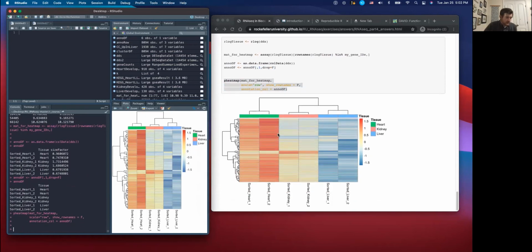And then we get our result. And so it's unsurprising. We've included everything in here because I often think it's nice, even if you're doing a pairwise comparison, if you have a larger data set, it's often nice to see what's going on in the other one as well.